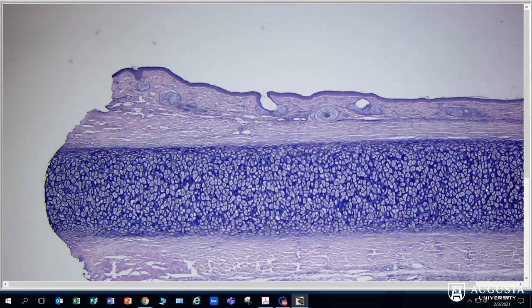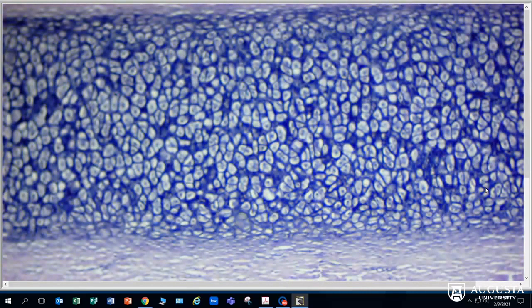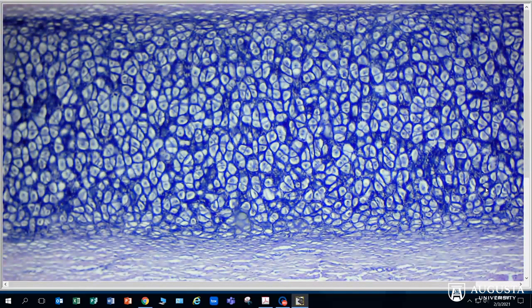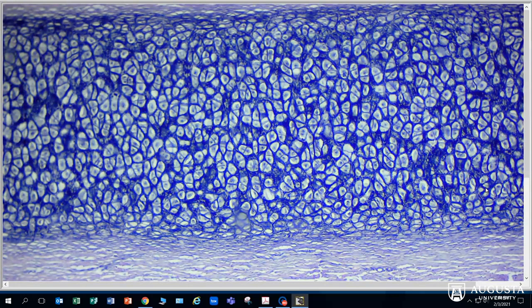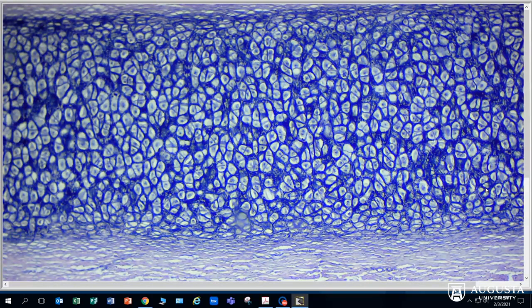We're moving to the 10x objective, and now we see that between those lacuna—if you have already watched the hyaline cartilage video, please do—between these lacuna we can see that there are some fibers.